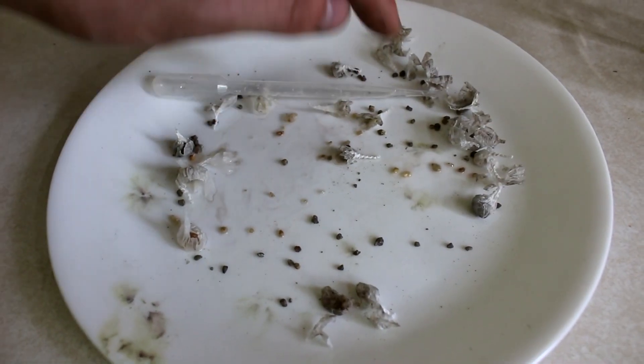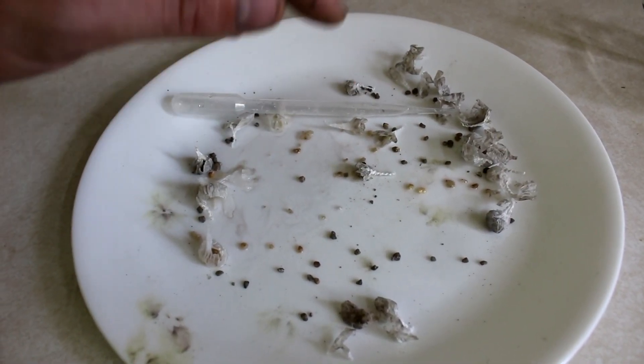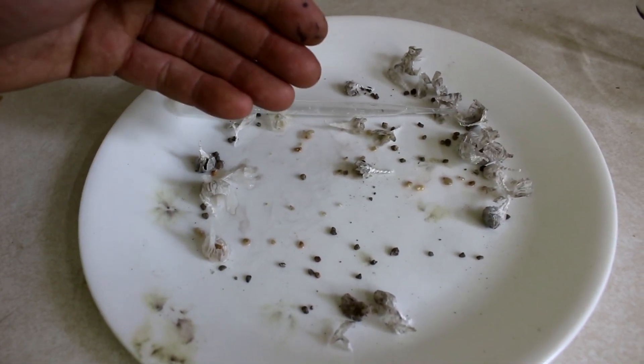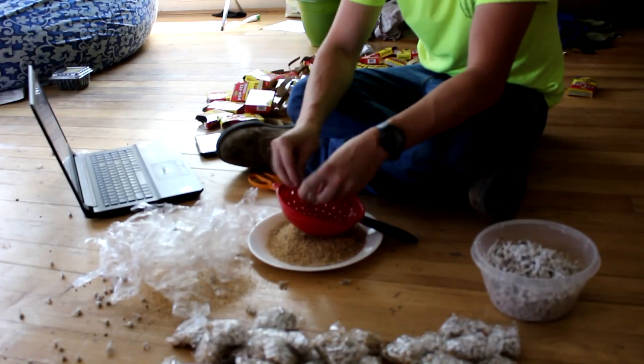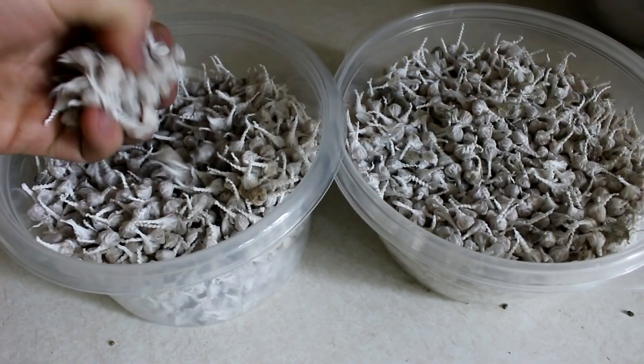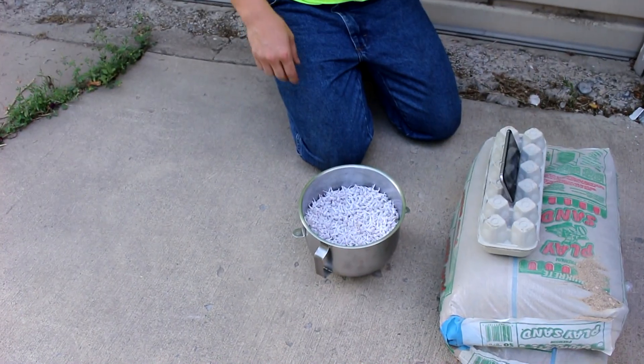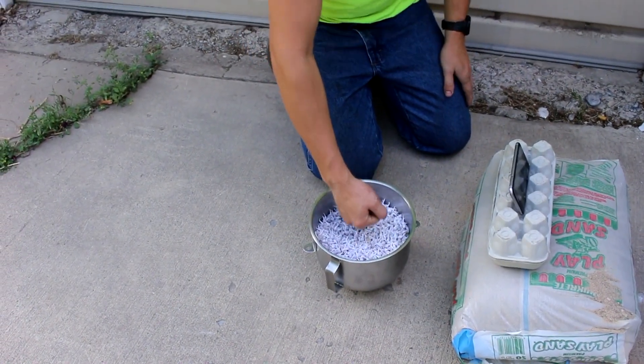Now they're only supposed to contain about 80 micrograms of silver fulminate each, so I'm going to need quite a few of them to recover a significant amount of silver. I went to the store and bought 100 boxes of these poppers, and after quite a bit of separating, I now have over 5,000 of them sitting in these bowls. Something I've always wanted to try is punch a whole bunch of these poppers — how about I shove my fist into about 5,000 of them? This might be rather stupid, but let's see what happens.